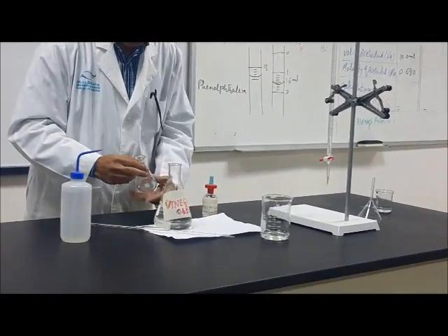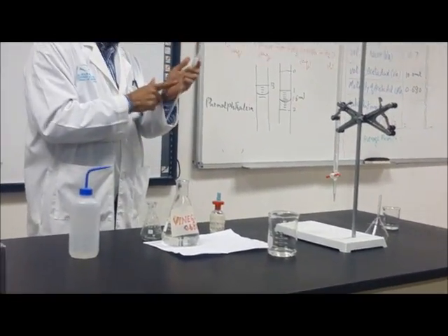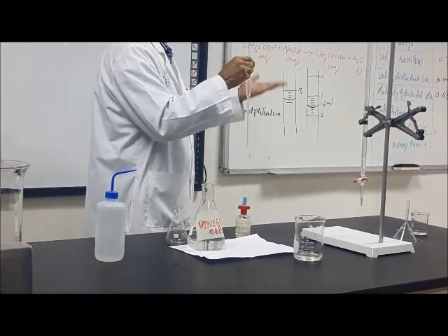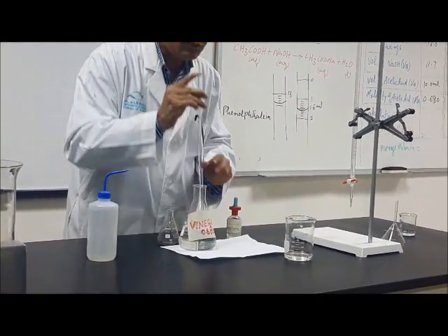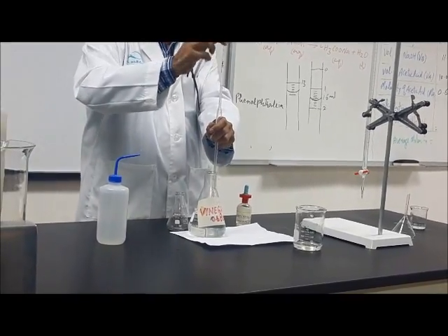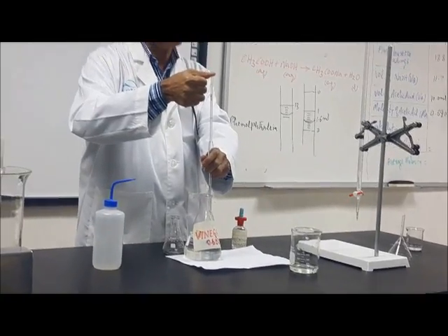Do I need to wash with this one? No, because there is already acid. Already washed with water, already washed with the acid. So when you take it, some students feel easy with this finger, and some students feel easy with this finger. It is up to you, whatever you like.